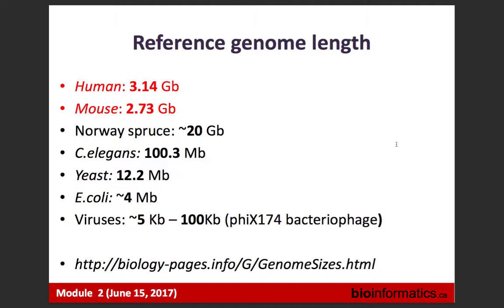Any questions so far? Genome is quite important. We should really pay attention to what genome we are using. Sometimes an experiment was done for human and people try to align to mouse. For sure, many reads will align. The alignment rate will be low, but it still will not be zero because we have good synteny between the two genomes. But that happens.